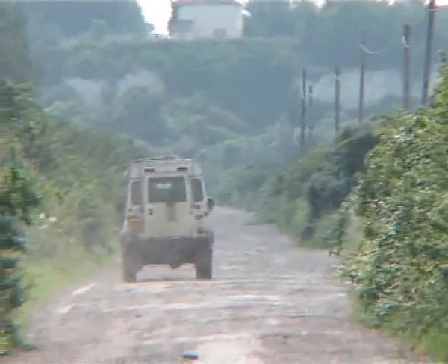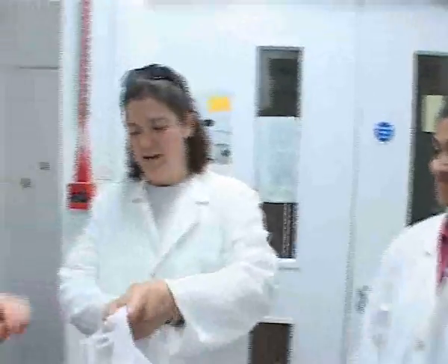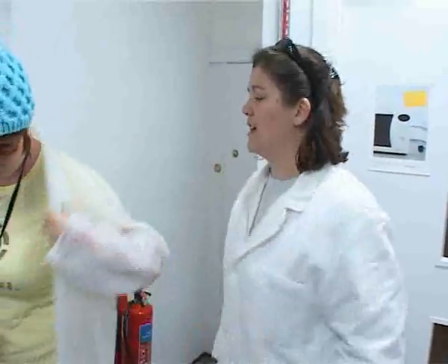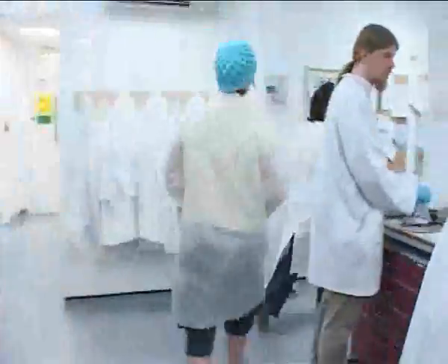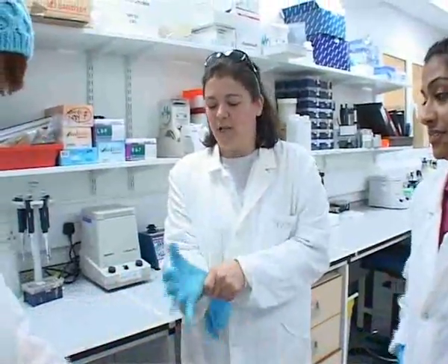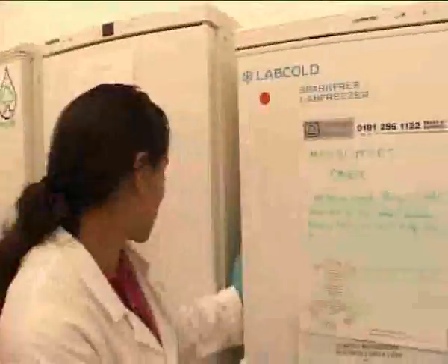So we're down here now in the molecular lab and you can see Ronita and I have our lab coats on — we've got one ready for you. Any time that you're working with DNA, it's essential that you wear a lab coat. It's really to protect yourself from any of the chemicals we're going to use but also to stop contamination from any hairs on your body going into our DNA and ruining our experiments. One of the first things you must do is wear gloves. So what we're going to do is go and get the mosquitoes that we collected as adults — we've actually put those in the freezer just to kill them.